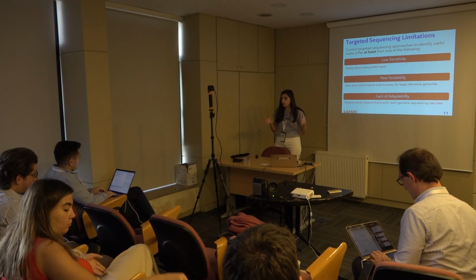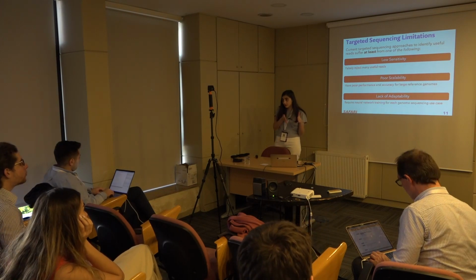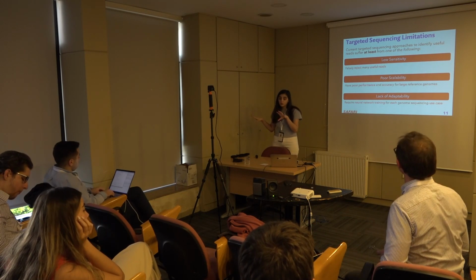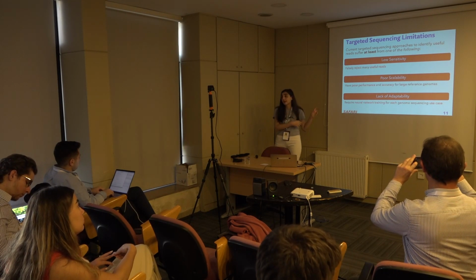And that's why you need to tune your similarity check component such that it only checks the initial parts, and it uses a noisy read that is coming from LightCall and tries to predict in that way. And doing that accurately is harder than doing the pre-basecalling filtering accurately.